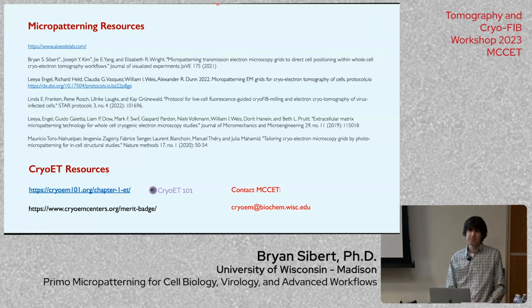Hey, that's a really interesting talk. I was curious if you've explored different patterns that optimize the amount of the edge of the cell if you want to image without milling. For example, like budding virus or something. Is there a pattern that you found is best for that application?